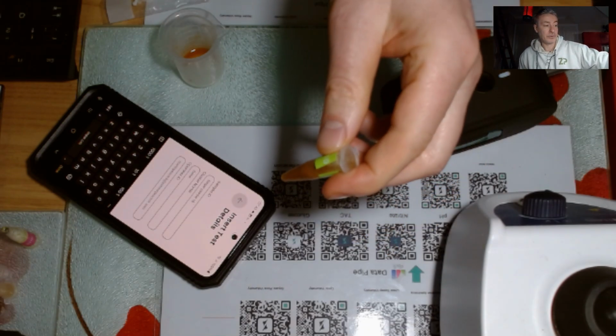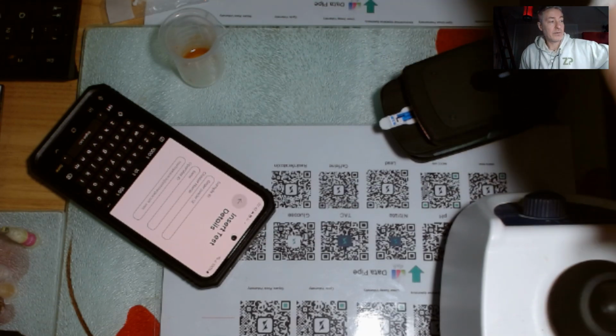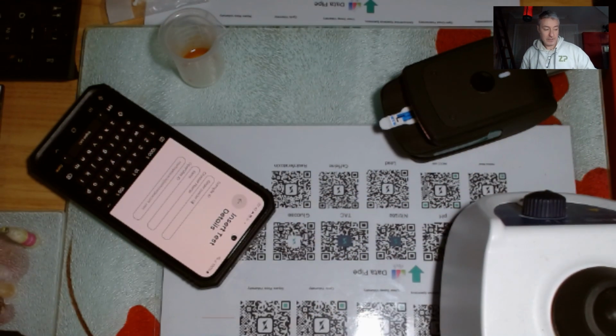I've got my sample here. I'll give it another quick vortex. Now this is not good. When I say not going to be good, ginger powders are quite intense with the amount of ginger oil they've got in there. That's a very thick powdery sample.